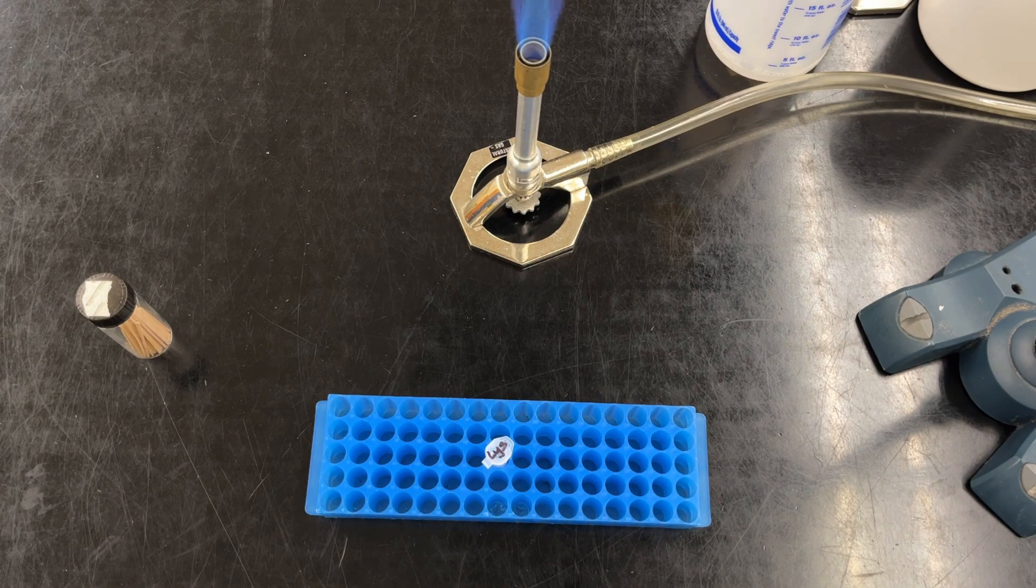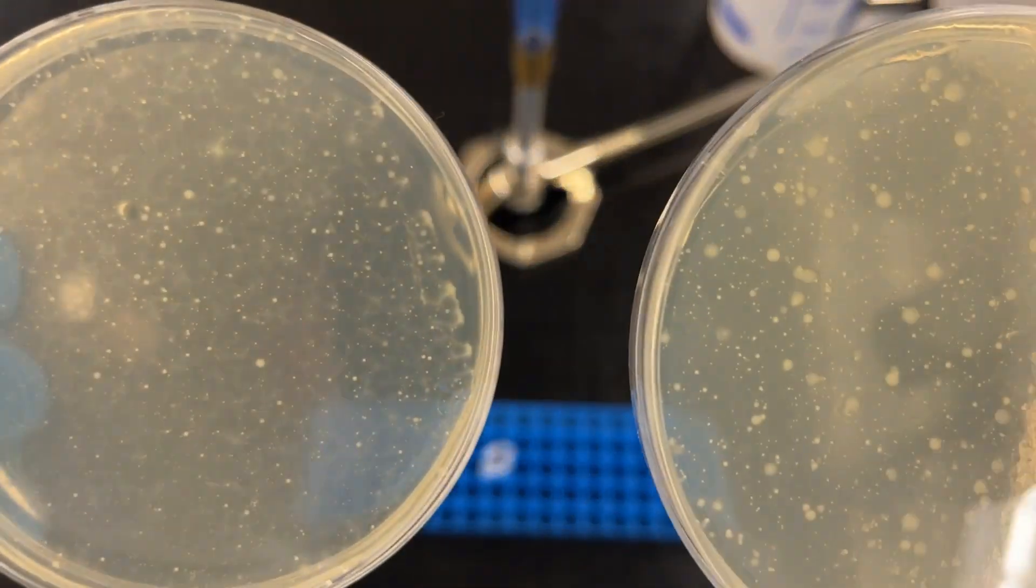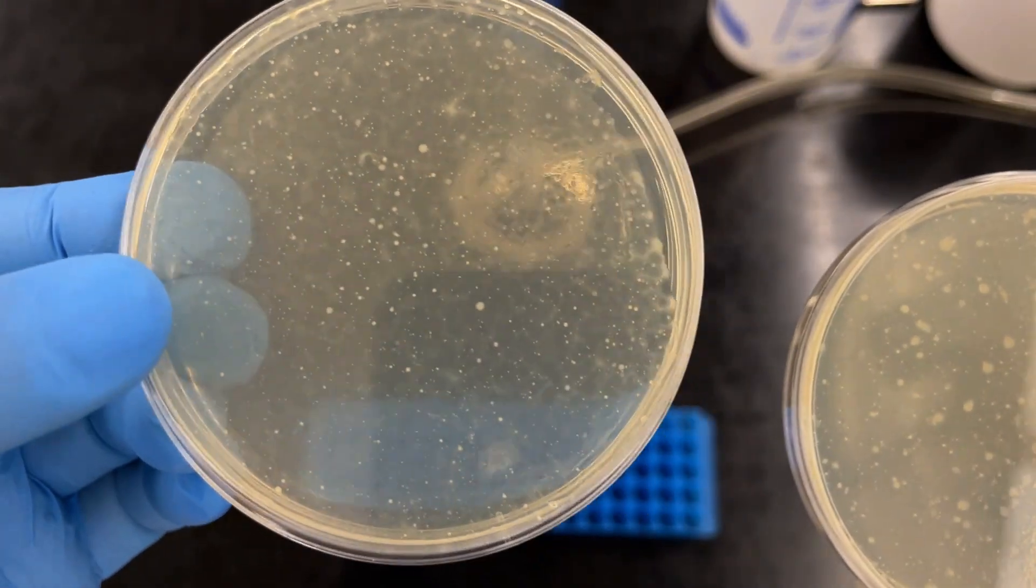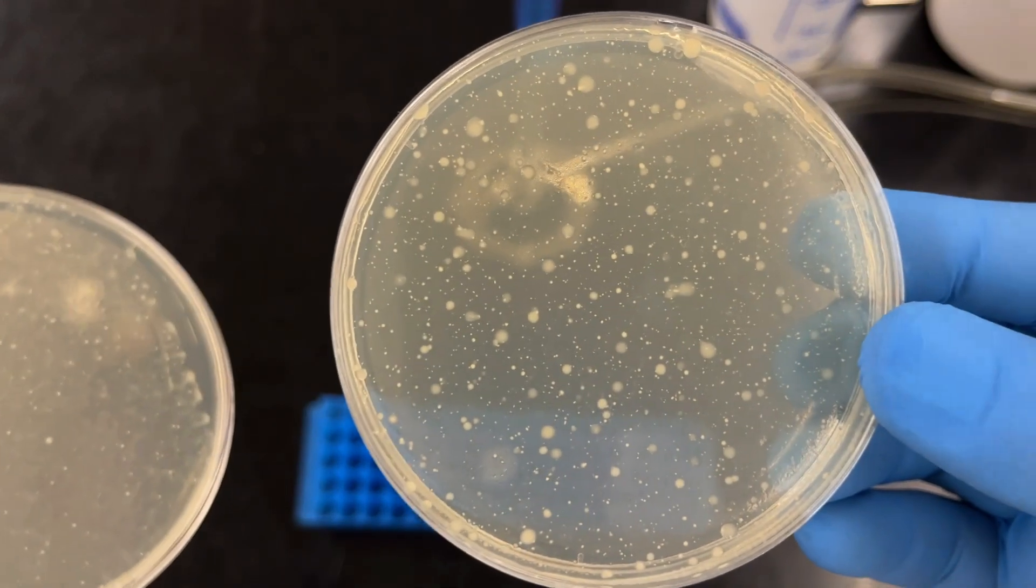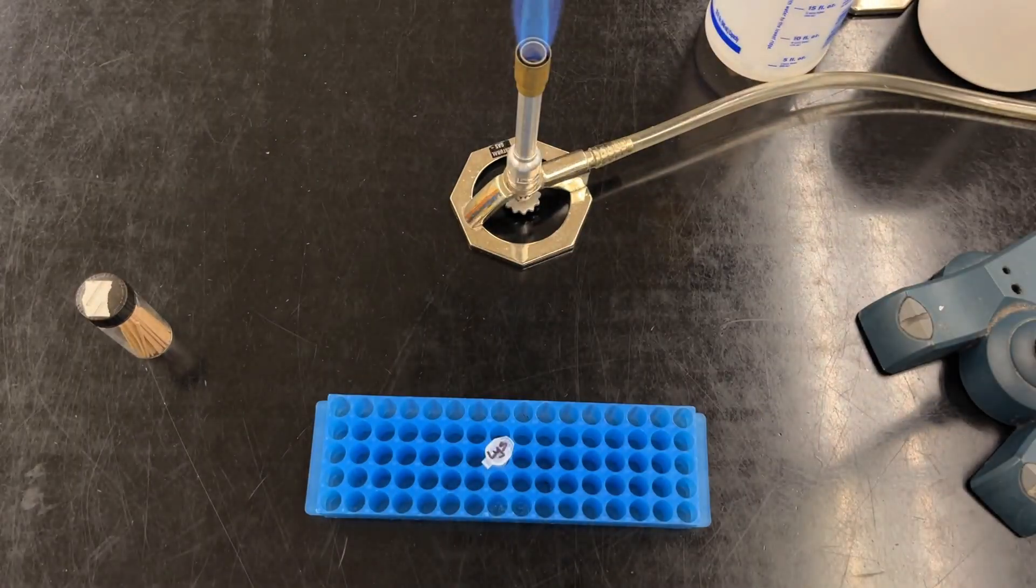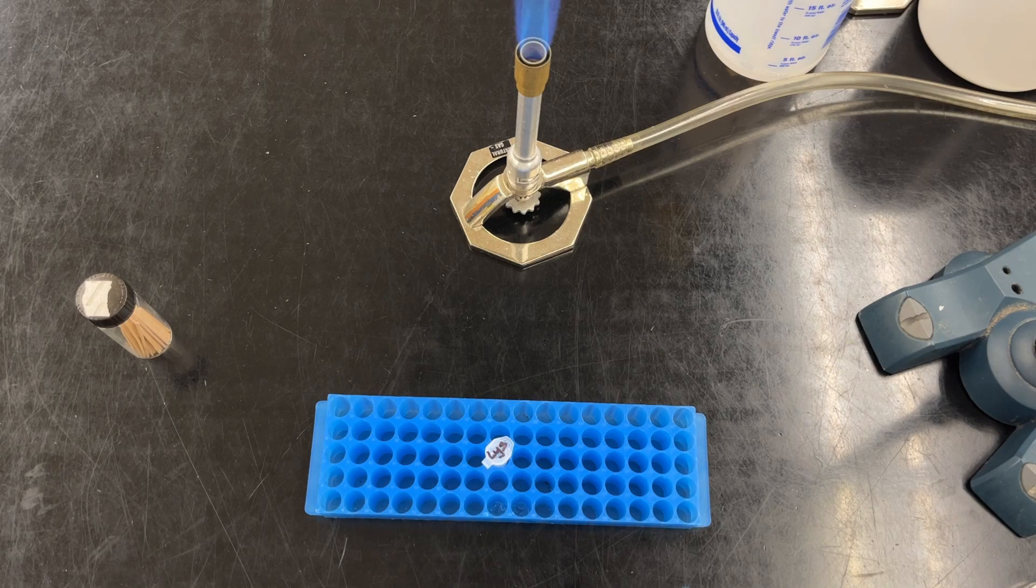So I'd like to show you what it looks like when there's just way too many bacteriophages. The plate on the left, you can sort of make out some plaques, but the plate on the right is just obliterated so all the bacteria are gone. And the growth that you do see here are just bacteria that are presumably resistant to the phage.